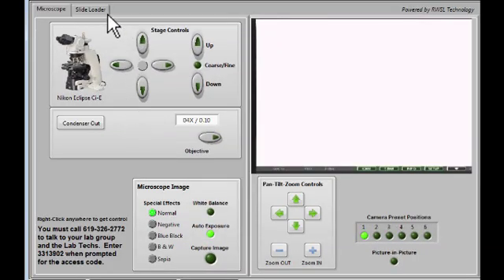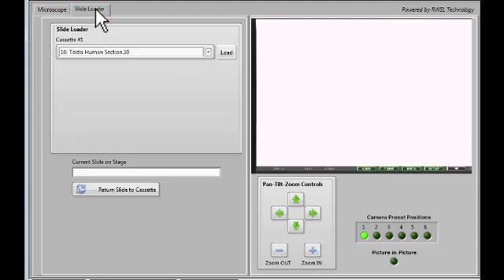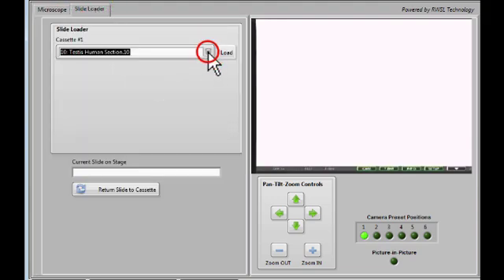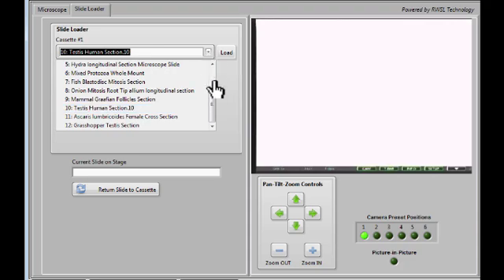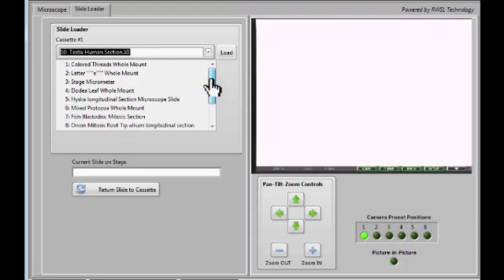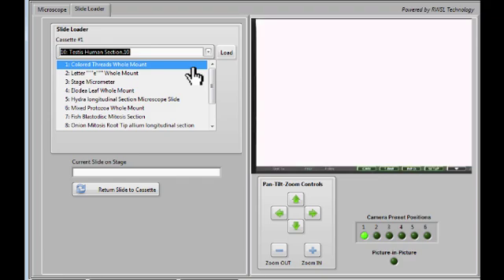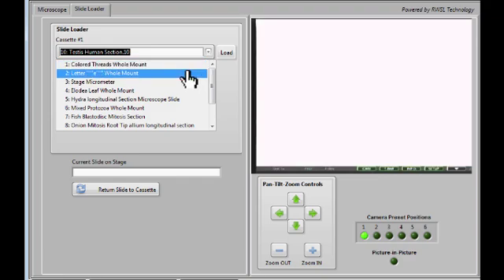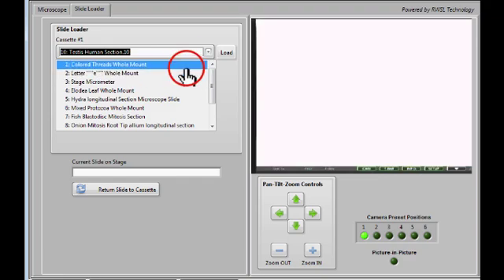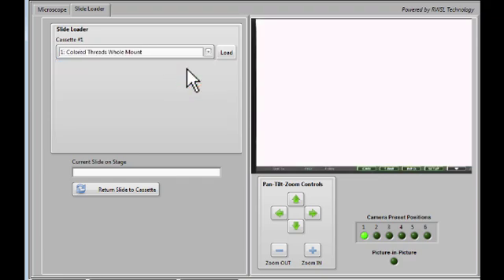To load a slide onto the microscope stage, click on the Slide Loader tab at the top of the screen. You'll see a drop-down list for up to four cassettes that can be loaded on the Slide Loader robot. In this case, we only have one cassette loaded.